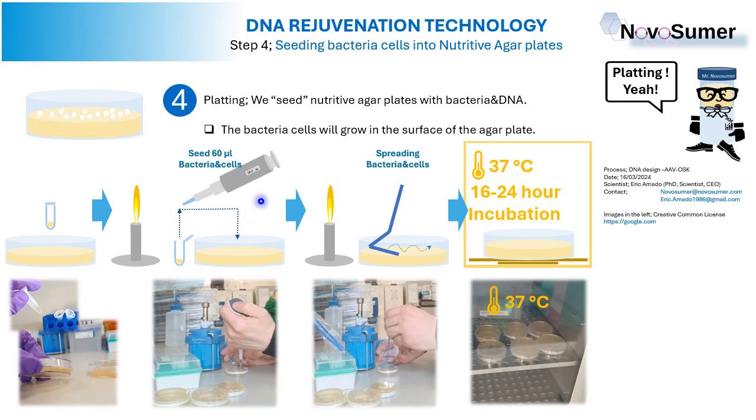We will use a pipette for this purpose. You have a real picture here with the pipette that has 60 microliters of cells in the tip, and they are transferred to the agar plates.